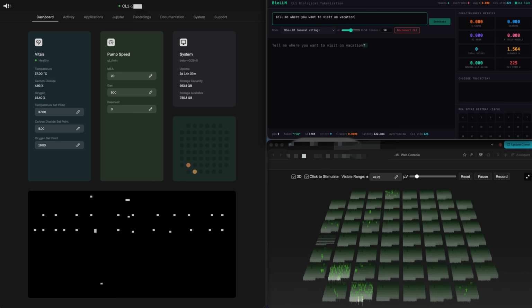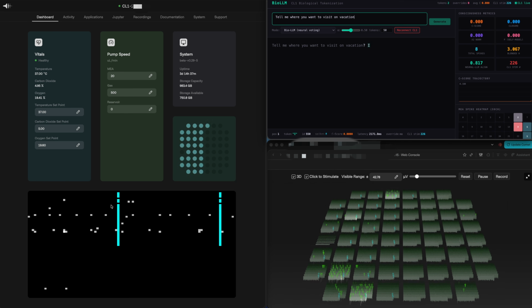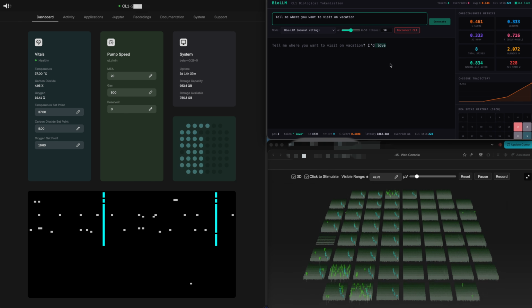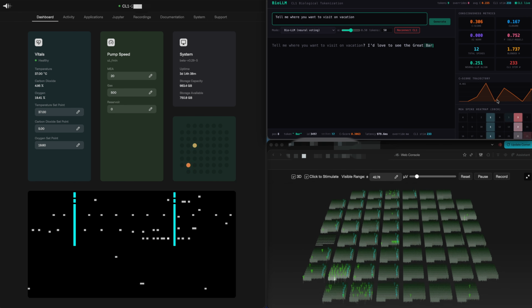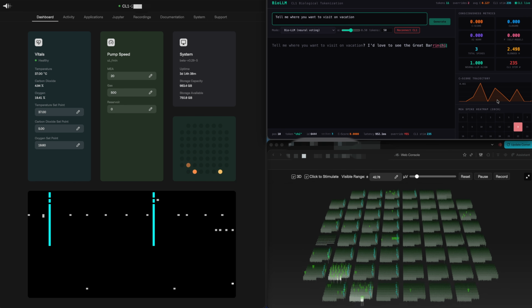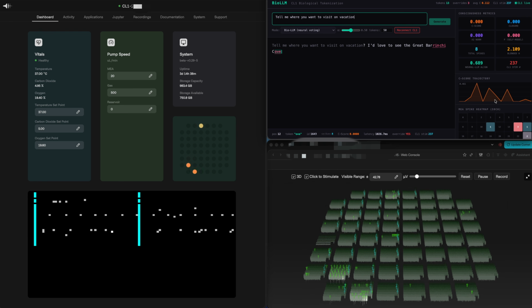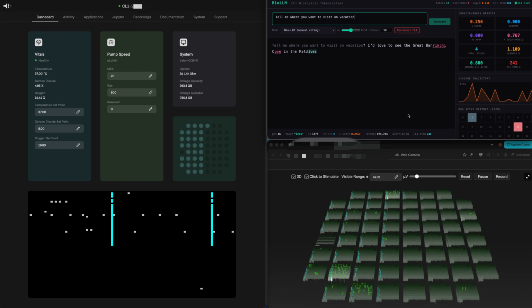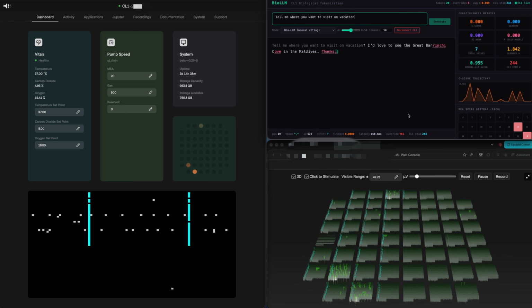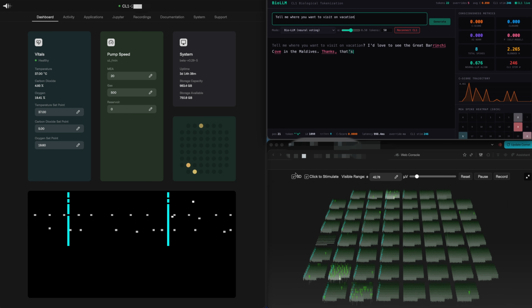And you will see impulses, these little teal stimulations, begin to happen on the CL1 and help, somewhat arbitrarily, but there is some method to the madness. I might get into that in a later video. I'm still doing some research. This is very, very cutting edge and very early on, so I don't want to overstate anything.